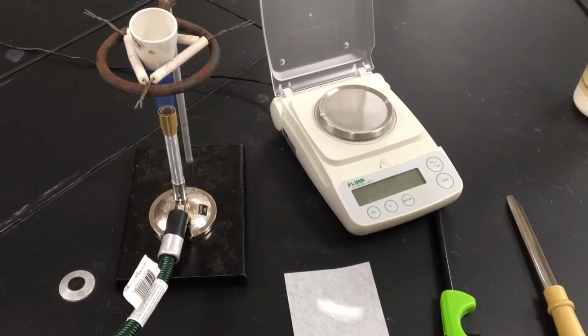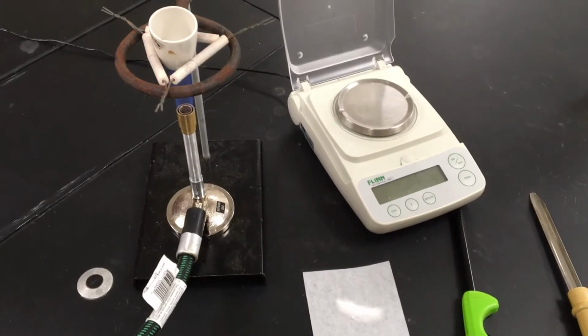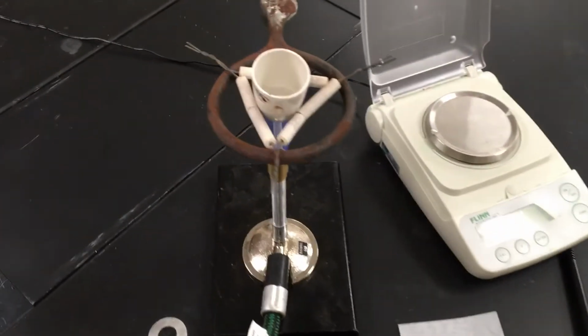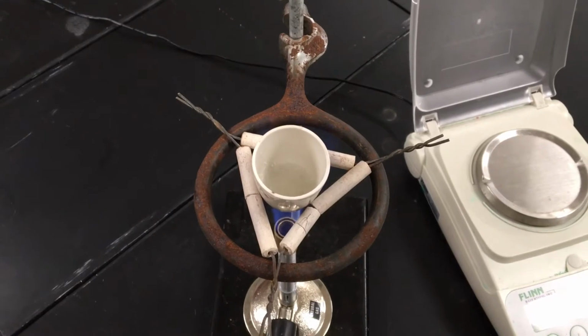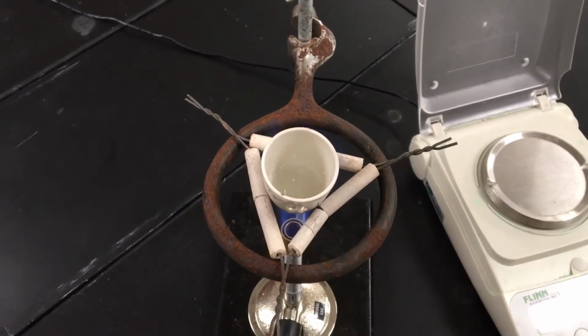Good morning, class. I've started to run your experiment here, which was on the alum, the hydrated mineral. And very quickly, I wanted to bring this to your attention here because I've started to heat up the alum, and I'm showing a little setup here.